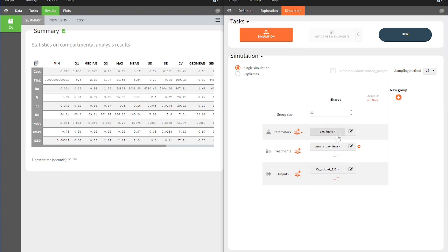The PK-PD parameters estimated by PK-Analyx will be used to simulate the new situation. The setup is now complete, so we can start the simulation.